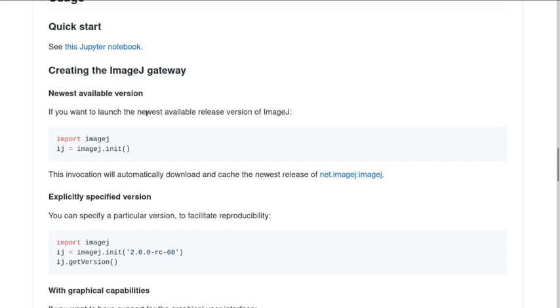You can then think about instead of doing all those button clicks on ImageJ, you could write a Python script that's going to open an ImageJ gateway and do all the button clicks based on the commands that you've programmed. And then, in theory, if this is something you do regularly, you just run your Python script with a file name, and that's your process done. So the idea behind it is a little bit like running macros, being able to batch process.